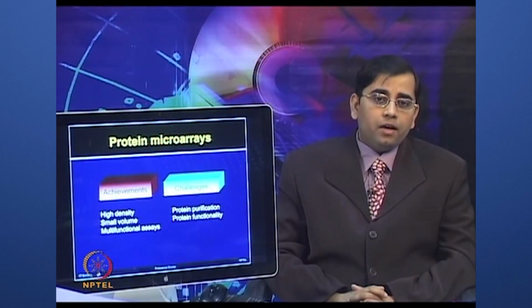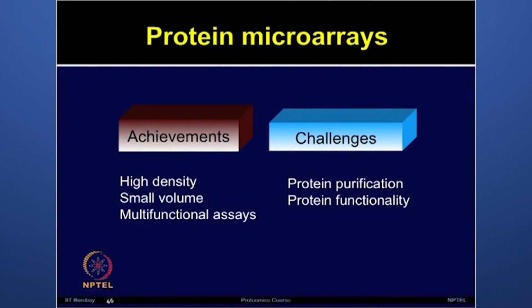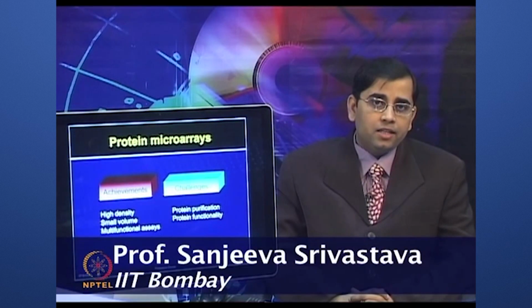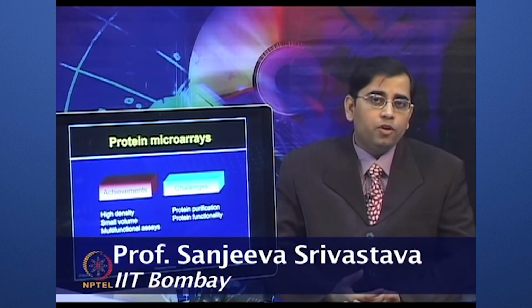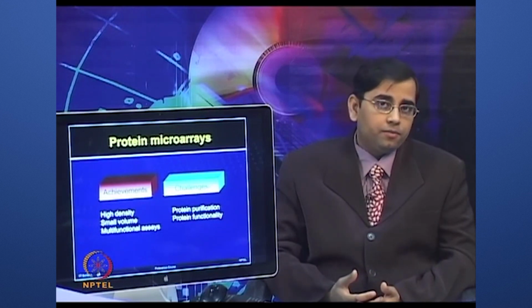Protein microarrays have provided a high density, high throughput platform, which is one of the major achievements of using this technology. A very small volume of clinical samples or biological samples or pharmaceutical samples can be used on these array surfaces and multifunctional assays can be performed. However, there are still various limitations and challenges of using protein microarrays, which include generating the protein content, its purification, as well as keeping it functional and stable on the shelf, that is, its shelf life.